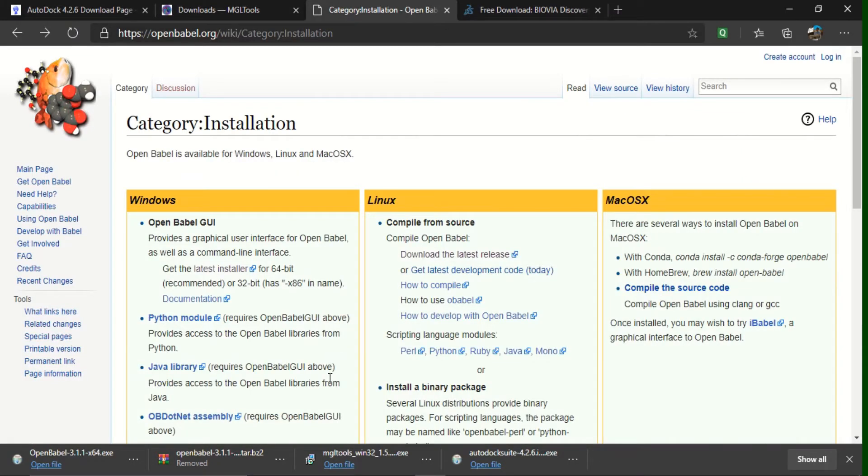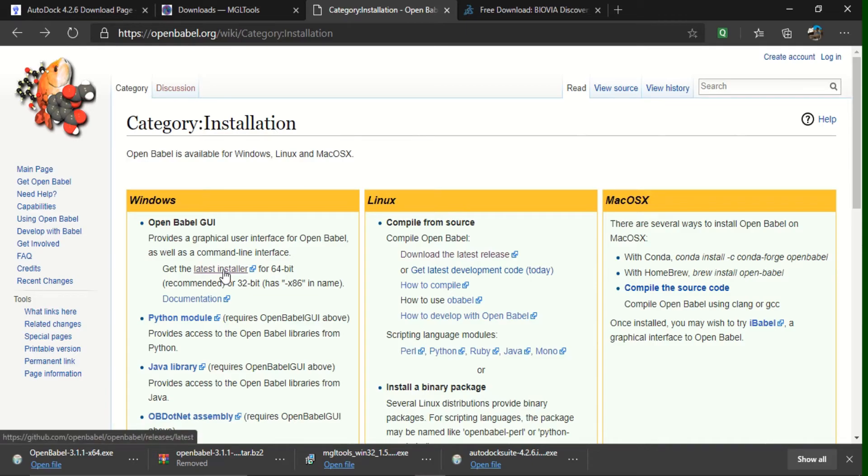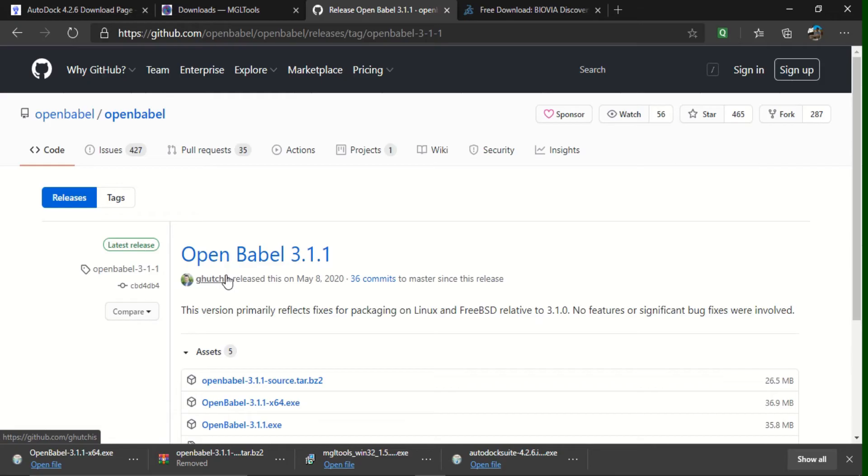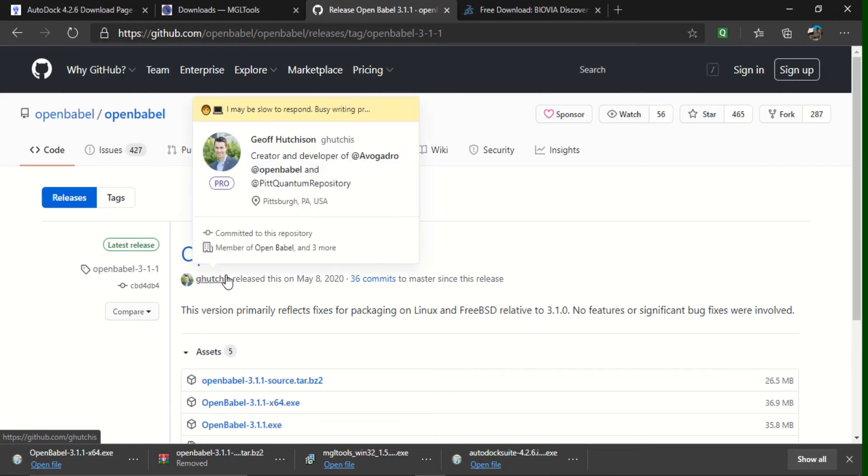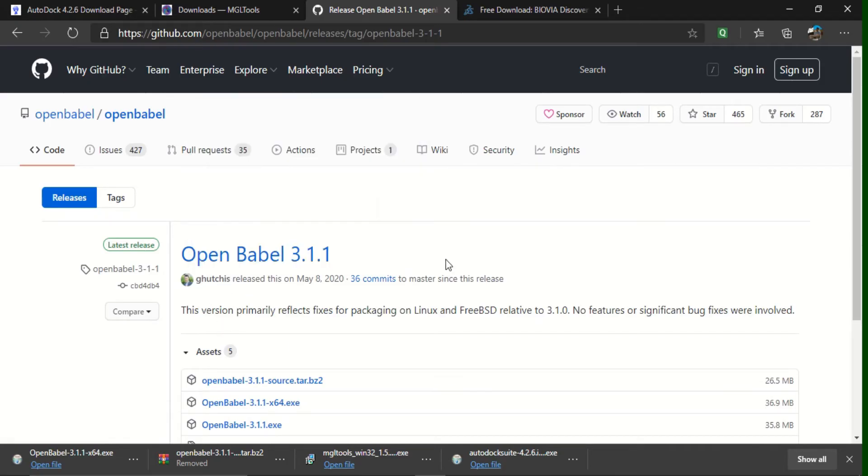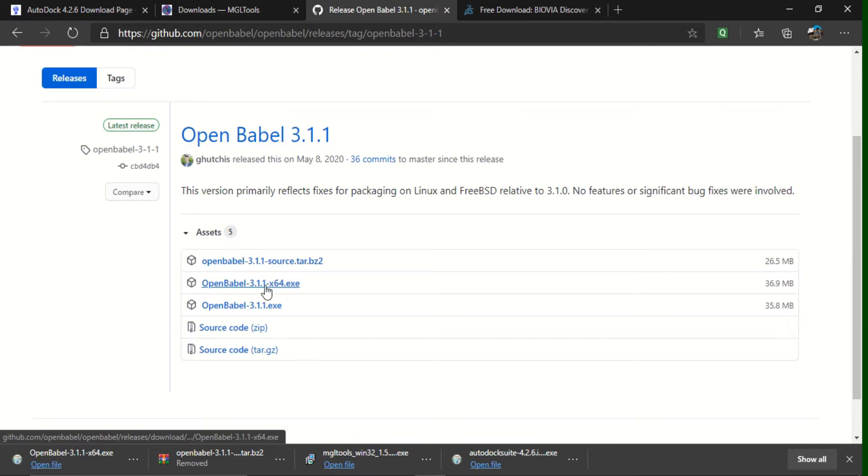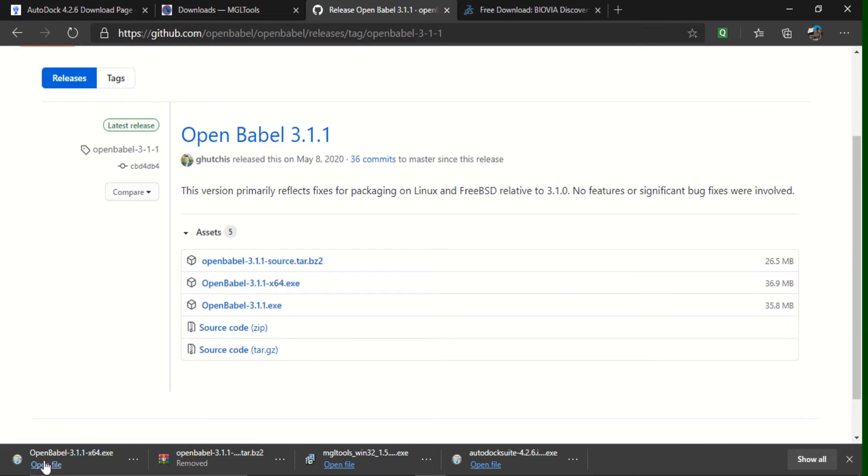And next, coming to OpenBabel. After opening this page, if you click here latest installer, a new page will be opened. Here you can see executable file. I have downloaded this x64 executable file, what you can see it here.